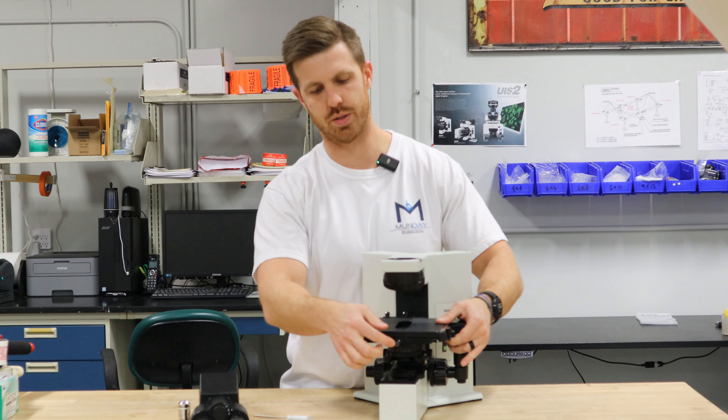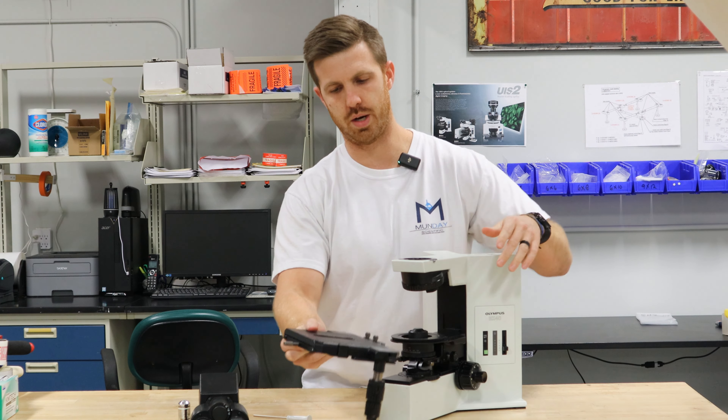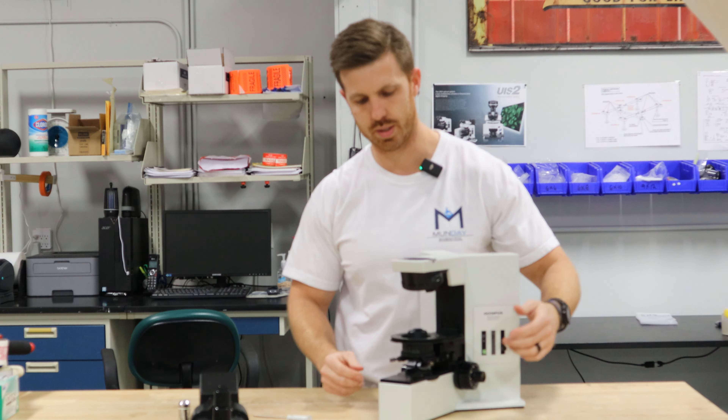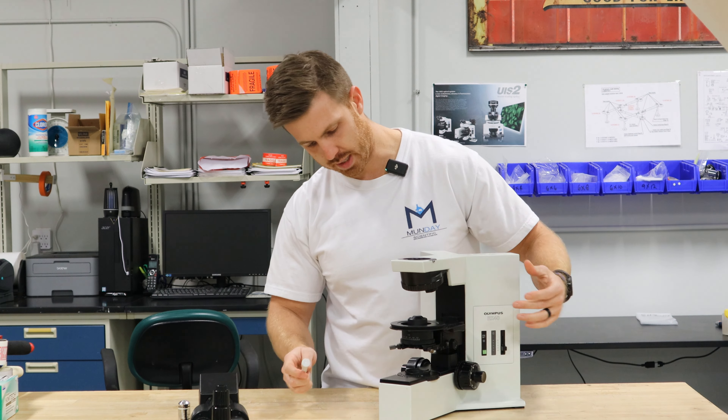Put that on the table there, and then you have a stage. The stage — there's a knurled screw in the front. Just loosen that off and remove it. You don't want to put pressure on the coax, so usually put that down, stage top down, and then we'll raise the focus mechanism back up.